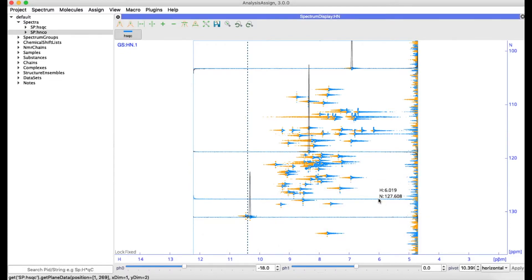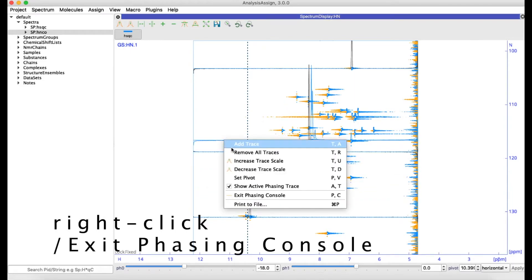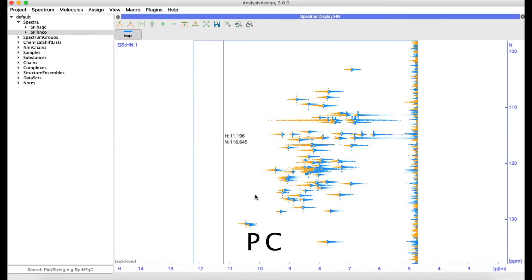Once you have finished phasing your spectrum, you can make a note of the phasing values and enter them into your NMR Pipe processing script. The phasing is not saved and directly applied to your spectrum within Analysis. You can exit the phasing console again using the right-hand mouse menu or by typing PC.